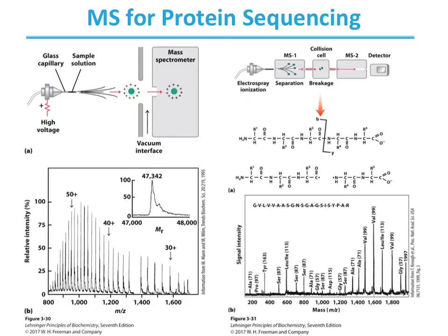Mass spectrometry has emerged as the dominant technique for characterizing and sequencing proteins, and it accurately measures the mass-to-charge ratio for ions in the gas phase. Until about 1985, macromolecules such as proteins could not be analyzed this way because the heat that was required to enter them into the gas phase was so high it would actually destroy the protein. However, newer techniques have addressed these shortcomings.